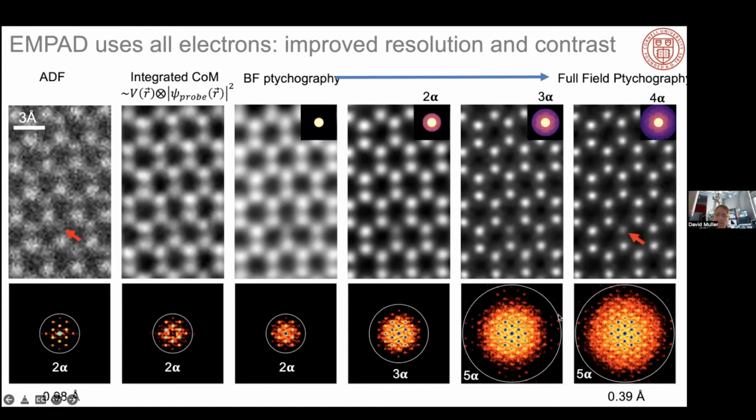So what do you get when you do imaging at these kinds of high spatial resolutions is now it becomes very obvious that there's a missing sulfur atom over here. If I wanted to look at a single crystal, I just take a diffraction pattern. But if I want to study defects, I need a real space image. So over here is a defect, and you have to have been very brave to have spotted that in the original image. But over here, it's extremely clear that it's exactly half the intensity of the other atoms. So this was our first paper, 2018. Yi was still a student.